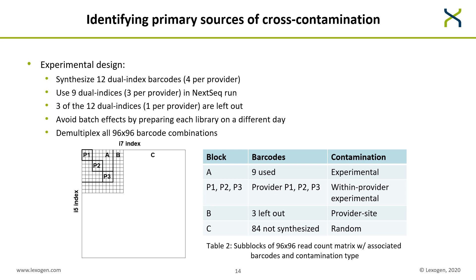The columns of this matrix are indexed by the I7 index and the rows by the I5 index. Different areas inside this matrix correspond to different types of cross-contamination. Block A corresponds to the nine barcodes used in the experiment, so the off-diagonal elements in A correspond to experimental cross-contamination. Blocks P1, P2, and P3 contain the barcodes for each provider, so within-provider experimental cross-contamination is reflected by their off-diagonal elements. Block B corresponds to the three left-out barcodes and reflects provider-site-dependent cross-contamination. The large area C contains the 84 non-synthesized barcodes and reflects random cross-contamination.